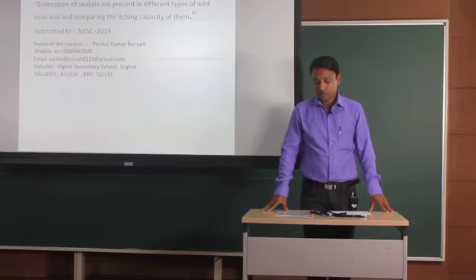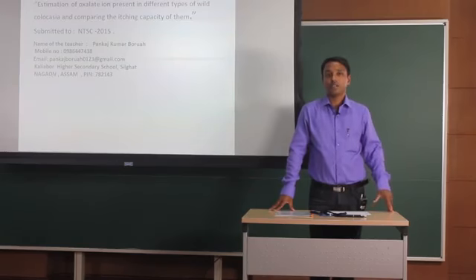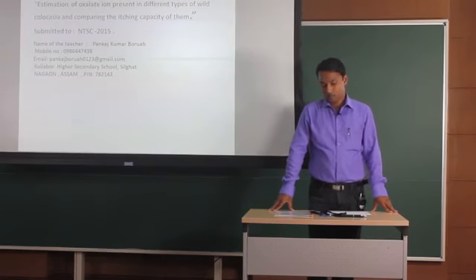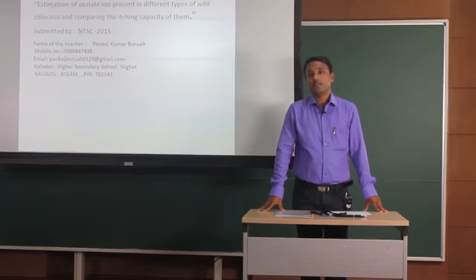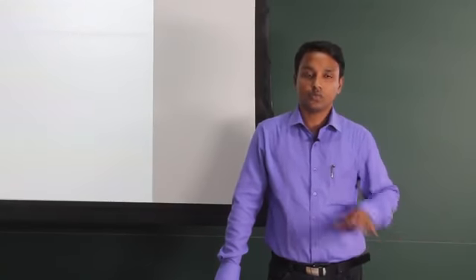My project was the estimation of oxalate ion present in different types of colocasia and a comparative study of their itching capacity. Colocasia is a common plant available in our locality. Since I belong to Assam, and Assam is full of colocasia, it is in my school campus also.